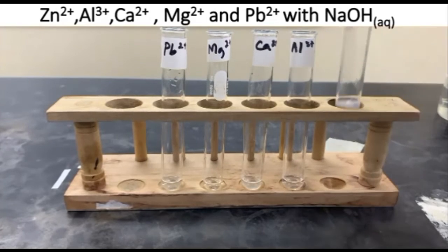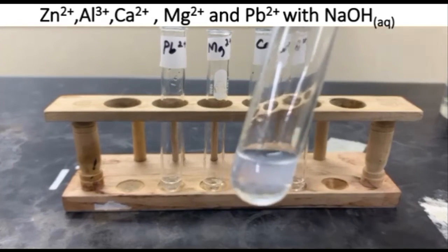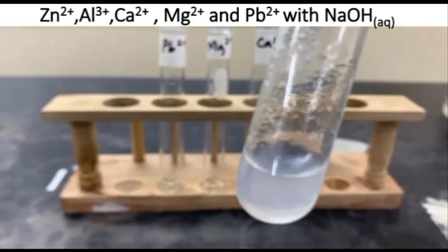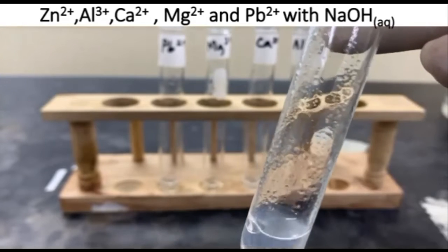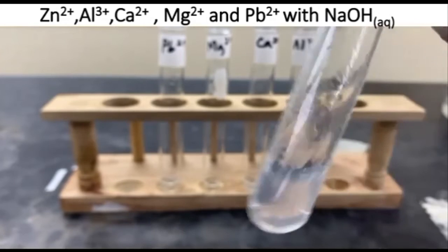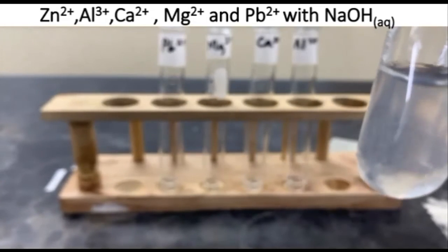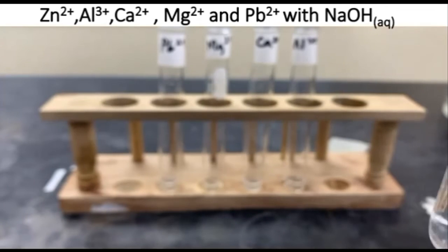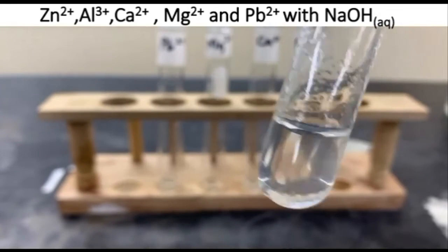Zinc, Zn2+, we're going to add a few drops of sodium hydroxide to our zinc, and as we can see, this is a white precipitate, looks gelatinous, so we're going to pour off most of it so we can add the sodium hydroxide in excess. So there we're adding excess sodium hydroxide now to the zinc to see if it's soluble. We still need to pour off a little more so we can add the sodium hydroxide in excess. And there we see our precipitate has dissolved.